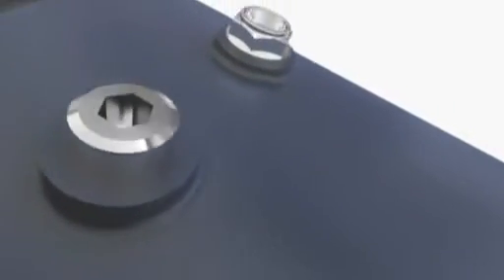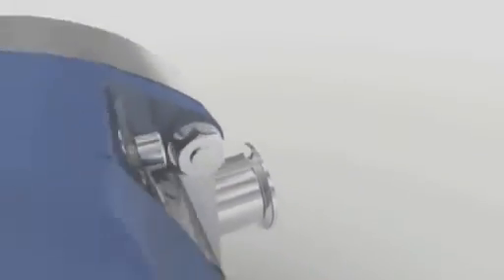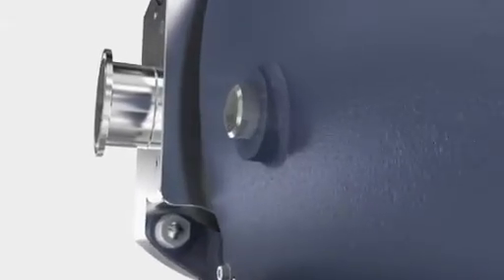The Optilobe is a member of the Rotary Lobe Pump family, which includes the SRU and SX. The Optilobe gives you cost-effective reliability. The SRU is our core rotary lobe pump and most comprehensive solution, while the SX is our premium product for ultra-sensitive and ultra-clean applications.